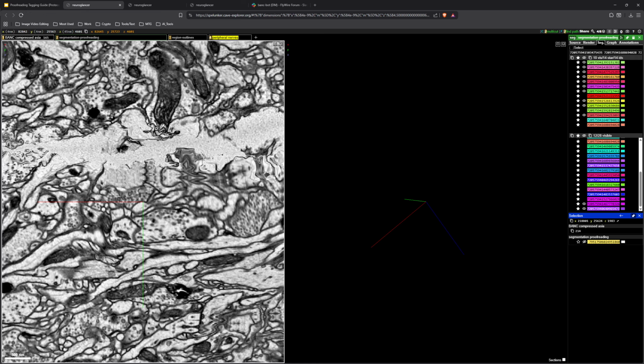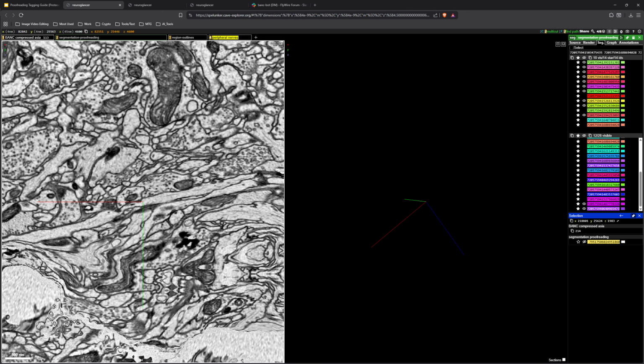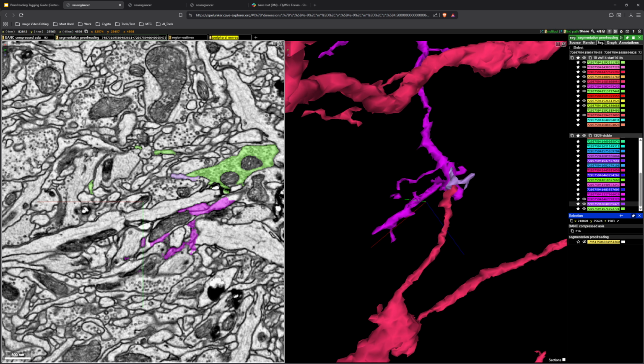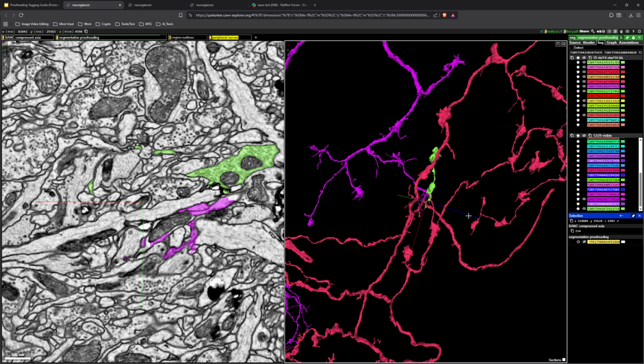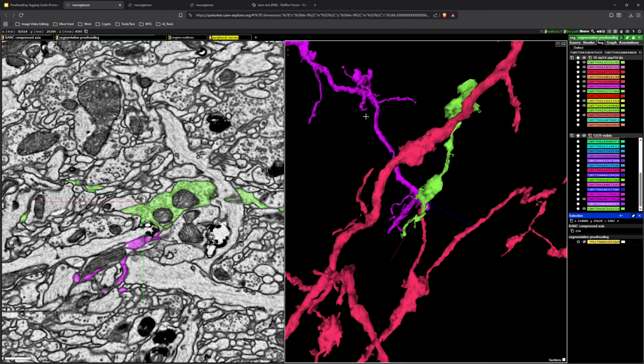So this larger piece, much easier to track with the eyes. As you can see, it's here. Here's a long, flatter thing. This sort of smaller shape we can see is possibly that shape right there. So long, flat thing, similar looking thing. And then we arrive at this right there. So this falls into the category of the type of branch we were expecting, which would be something about that size. So I'm already pretty confident that this is the way and that is not the way.